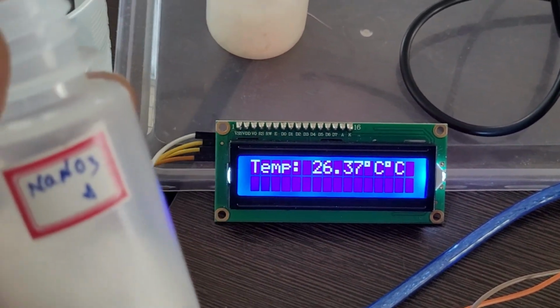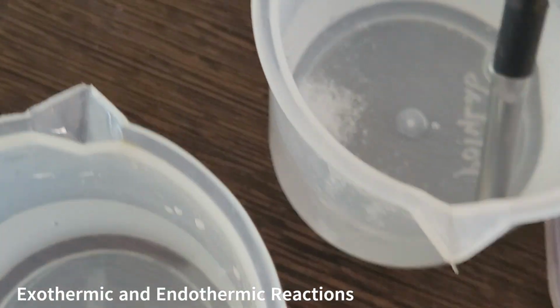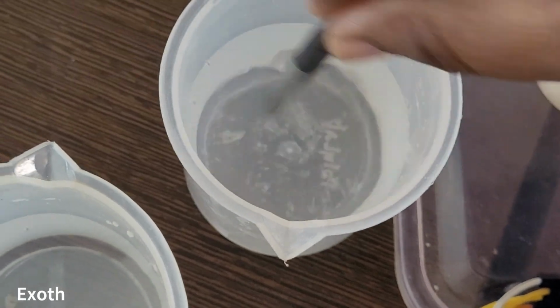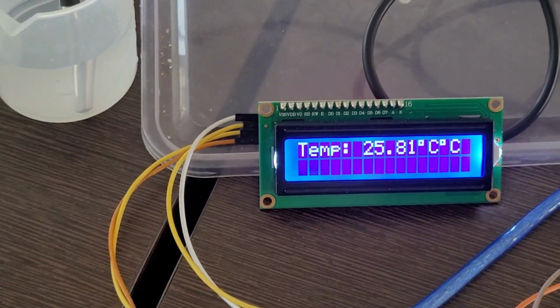Exothermic and endothermic reactions. This experiment demonstrates how certain chemical reactions release energy and others absorb energy. Students use temperature sensors connected to Arduino to track temperature changes.